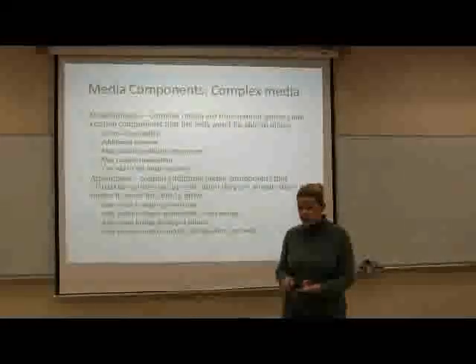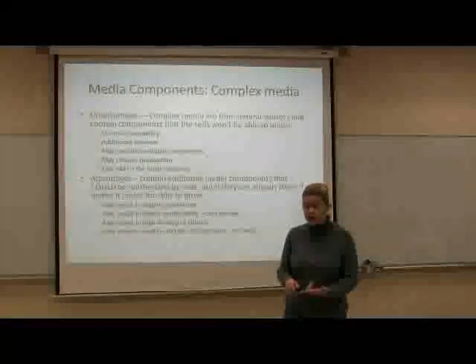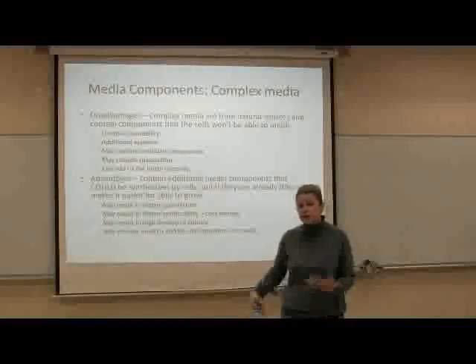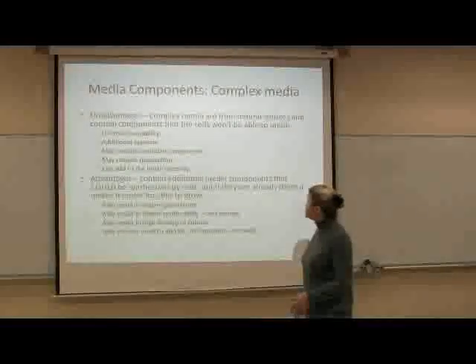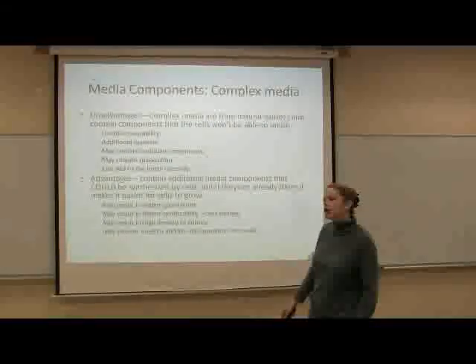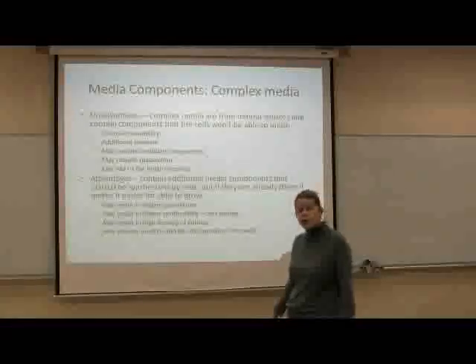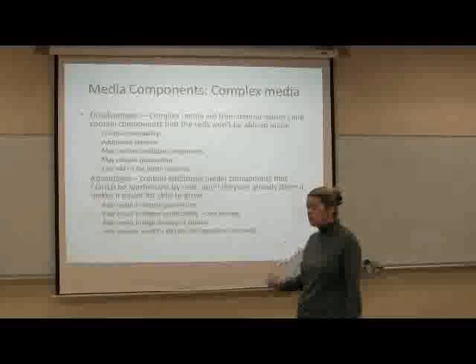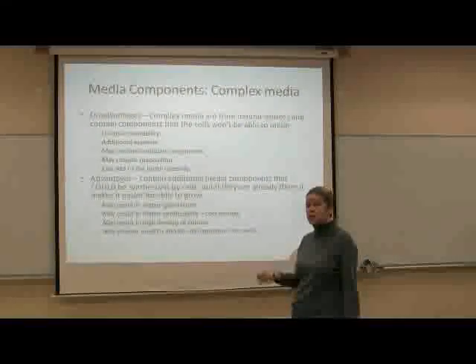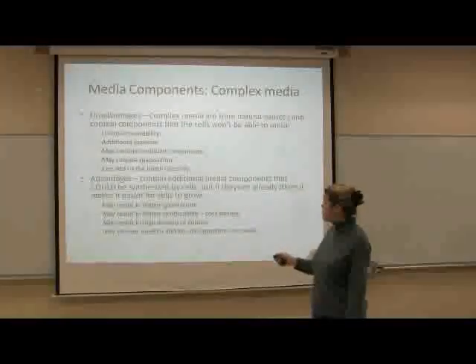Okay, so the disadvantages of using complex media are that it comes from natural sources, right? Tryptone, I believe, is a digest of milk. That's what it smells like. And then yeast extract. So these start from natural sources, so obviously the composition of them is going to vary. And so you're going to get variability, and it can cost more, but it may not cost more. There are some complex media which are really low cost, and they provide nitrogen, proteins in a low-cost way that can actually really boost the productivity of your process. So it depends on what outcome you want to achieve.